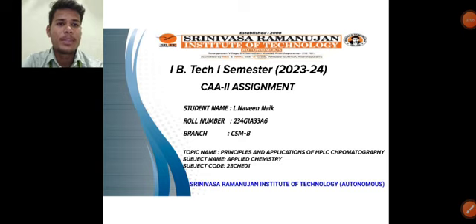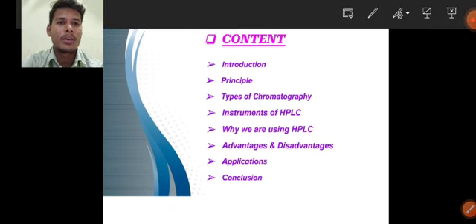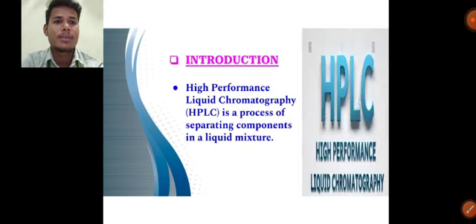Today my topic is Principle and Application of HPLC Chromatography. The contents: introduction, principle, types of chromatography, instruments of HPLC, why we are using HPLC, advantages and disadvantages, applications, and conclusion. These are the topics to discuss.